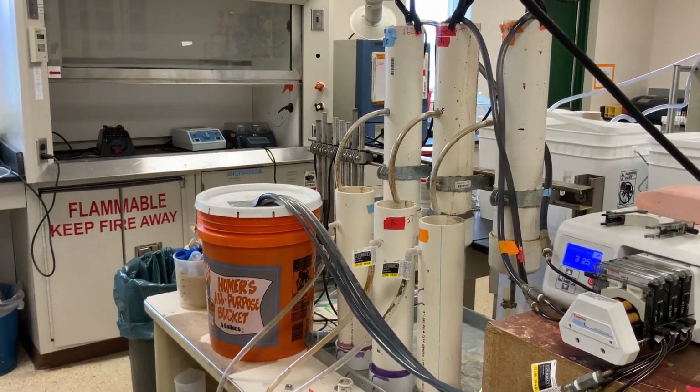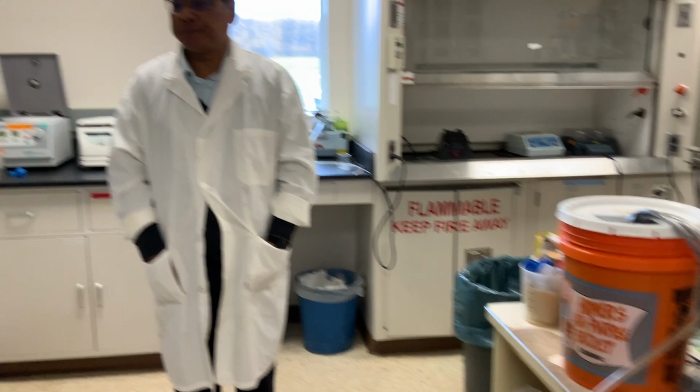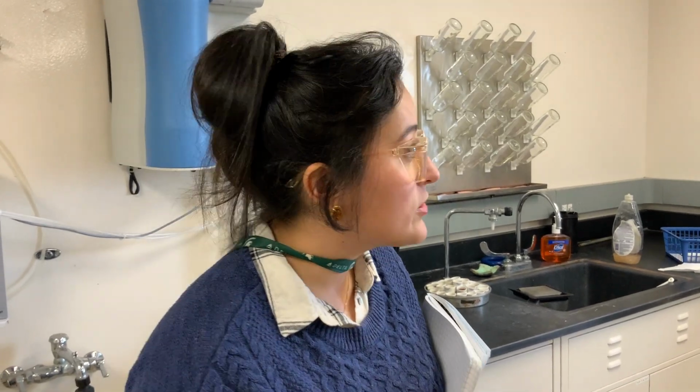So I monitor it twofold. The first way is COD. I measure COD in the sewage going in, and then I measure the COD in the effluent. Additionally, I'm working with Dr. Joan Rose over in Natural Resources and doing coliphage work with her. So I work with those indicator viruses that infect E. coli, and I look at the concentration of the phage going in with the sewage, and then how much is coming out.